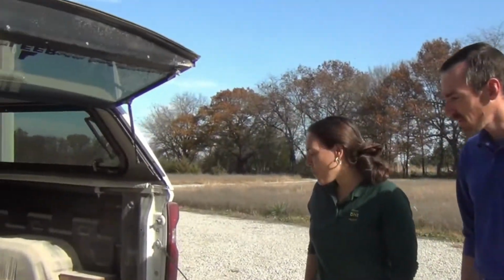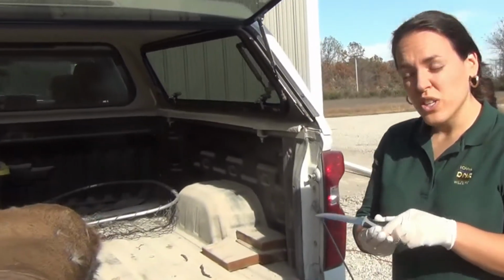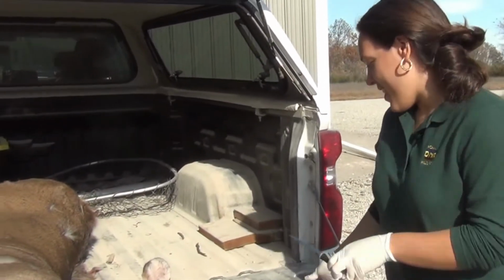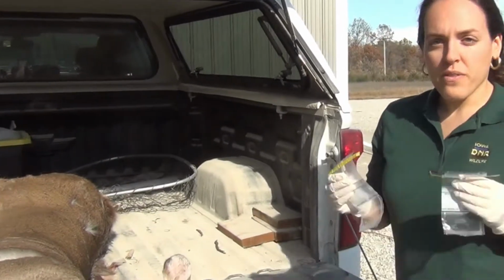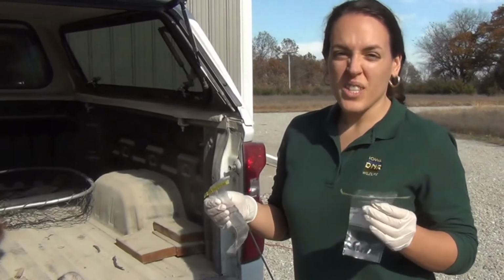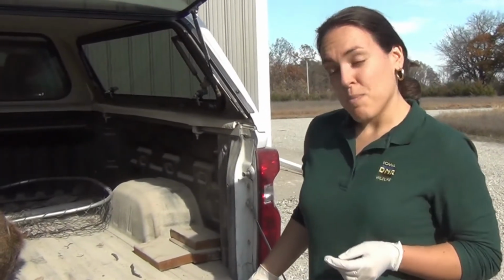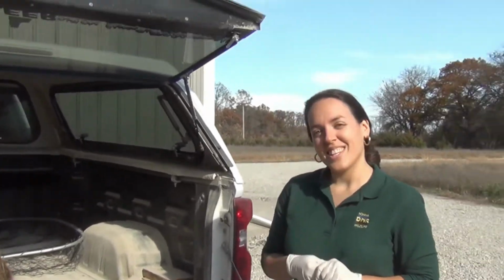So first you need to know what equipment to have. Basically you just need a fillet knife, some sort of sharp knife to collect your sample with, and then we have our official whirl packs that we're going to put each lymph node into, but you can just use a Ziploc baggie, something like that would be perfectly fine. And we'll talk about the paperwork on the tail end of this video.